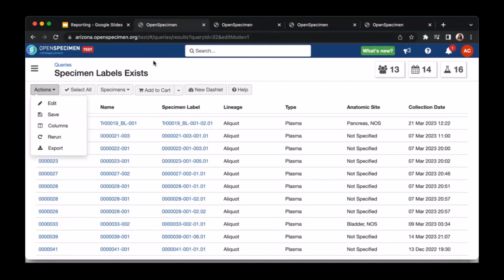Yeah, I think so. So it's based on the query that's before it, or is it that each subtype has a special sequence number? So basically, is it just taking the output from the query that's above that line and then saying, okay, we'll take the first one for each visit, basically? Or parent, each parent specimen, broken down by visit. Correct. Yeah, correct.